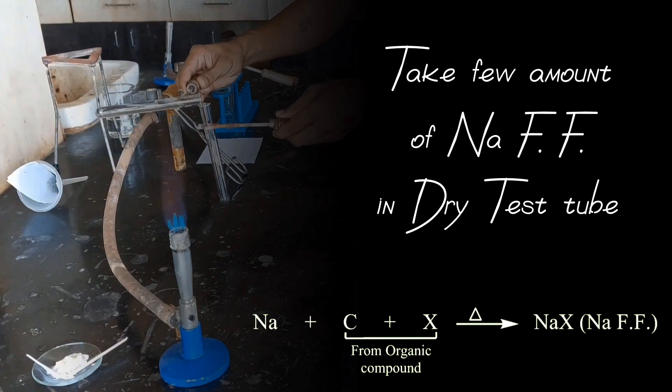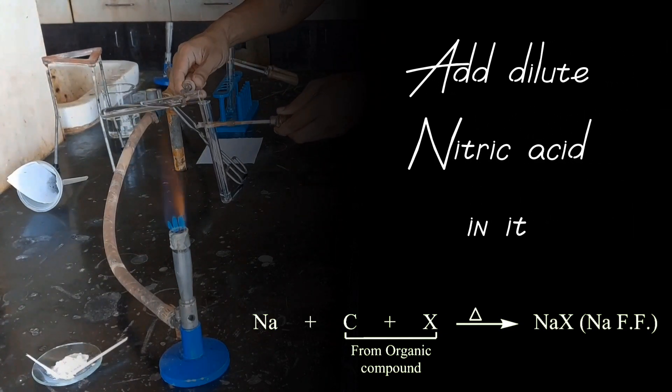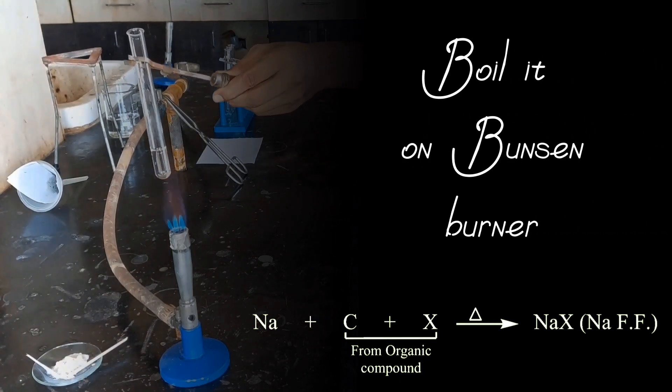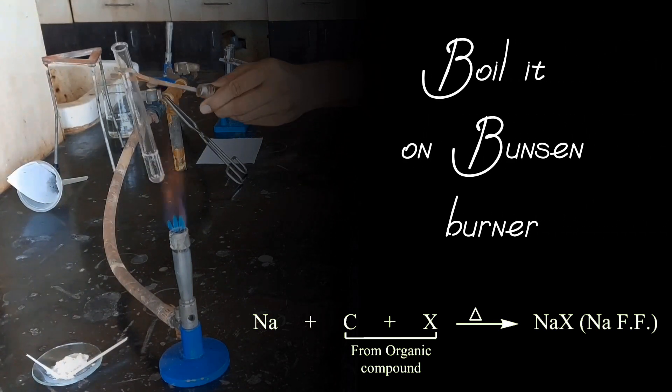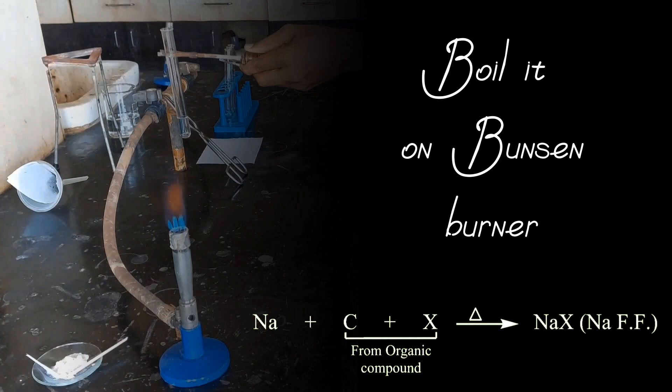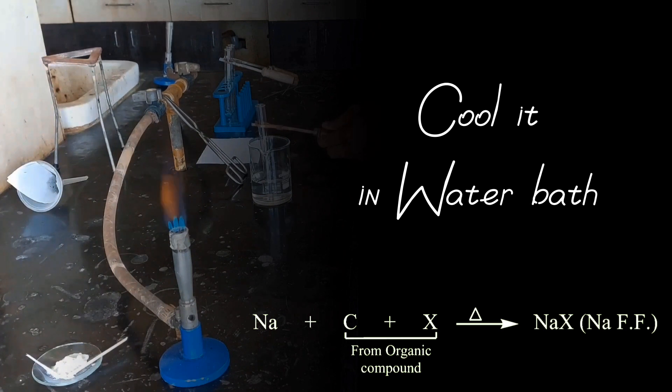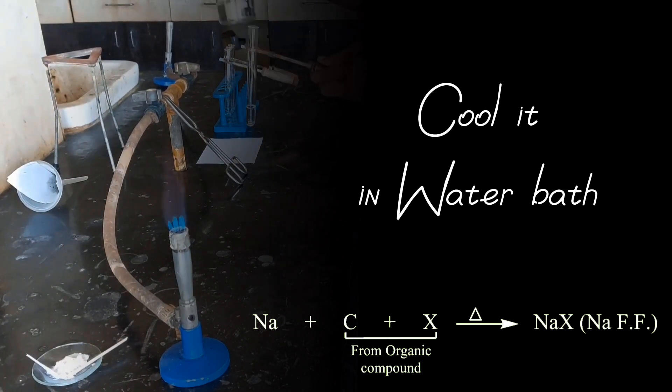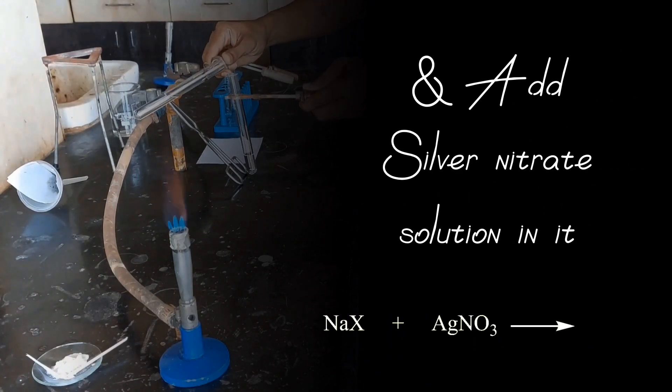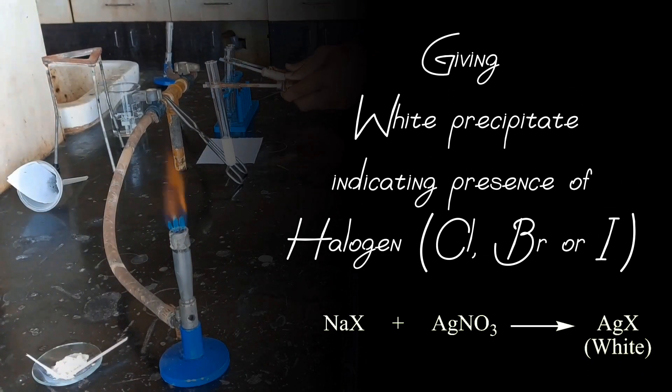Now let us do detection of Halogen. Take few amount of sodium fusion filtrate in dry test tube. Add dilute nitric acid in it. Boil it on Bunsen burner and add silver nitrate solution in it, giving white precipitate indicating presence of Halogen.